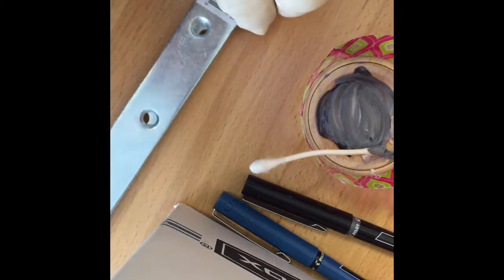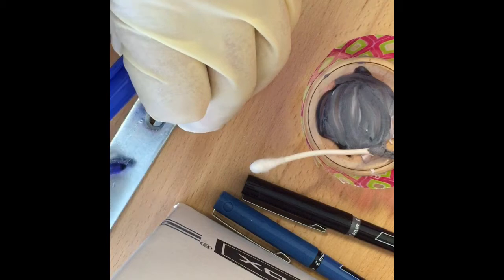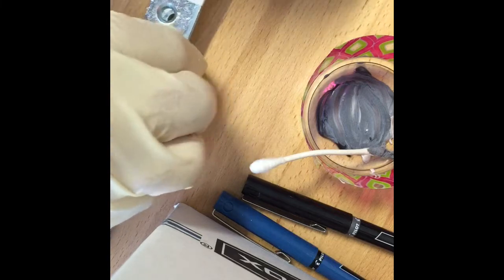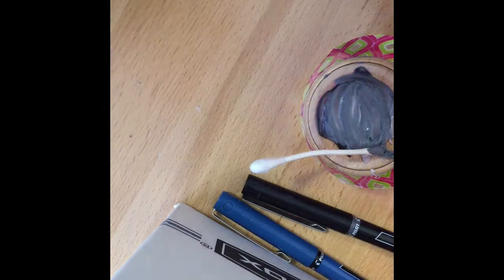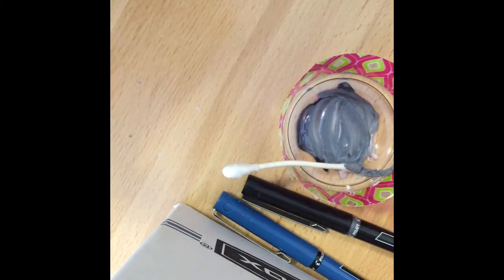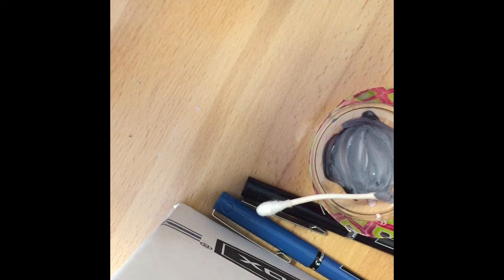Alright. So that's there. Label this one B. You can already feel that it's moving more fluidly, even though we just barely set it. It's shifting around a lot more than the A1 did. Set that off to the side. Now for column C. So we did 3 parts of resin there. So now we're going to do 3 parts of the hardener for the epoxy and 1 part resin.